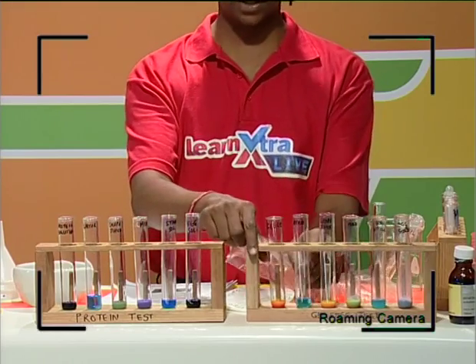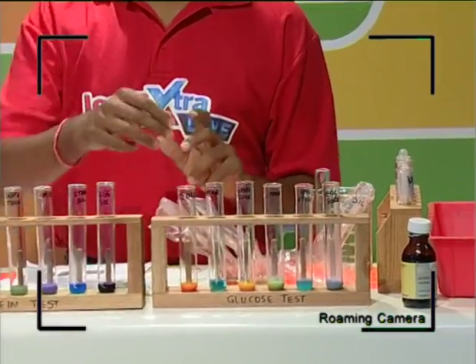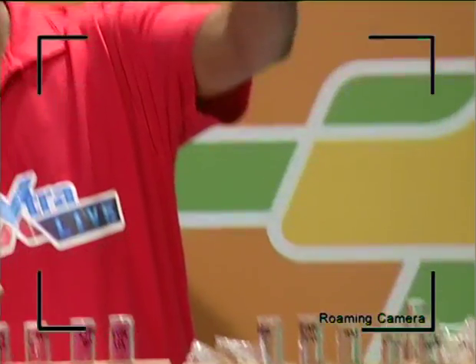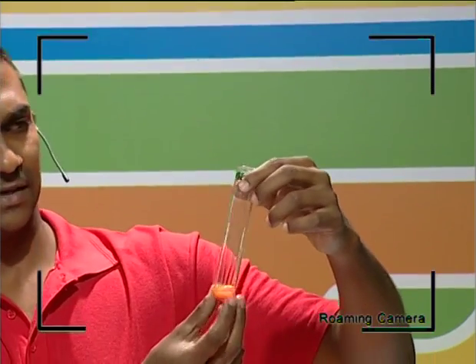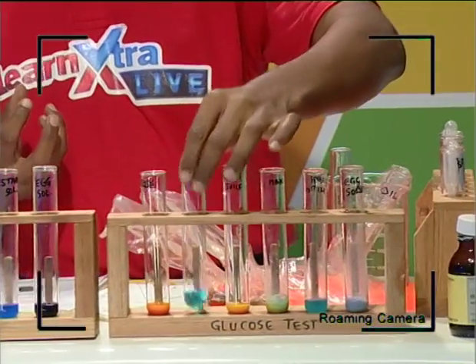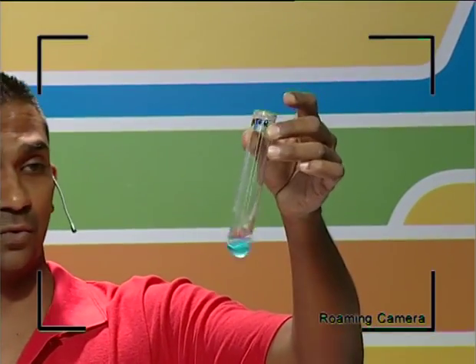So the first test, which is glucose, we used a positive control, and in this test tube we used glucose. And obviously this is the positive test. So it's given us, if you look at this, guys, a nice brick red precipitate that actually is beautiful. It looks nice and red, indicating a strong presence of glucose. Then we tested the water, whether it had any glucose. And if you clearly look at this, guys, in the water there's no glucose.